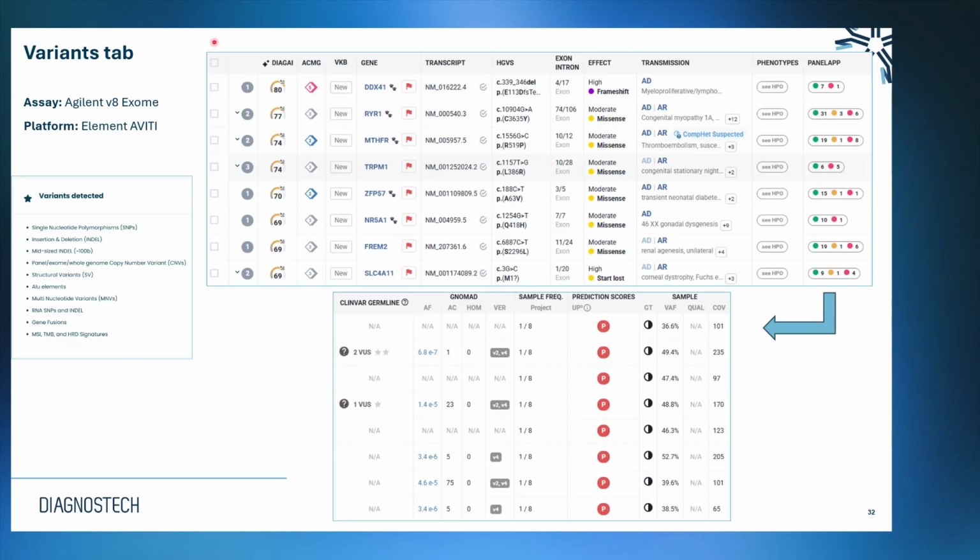So what we're looking at here is really the first step of variant interpretation. This is after the tertiary analysis has completed, and I've just taken a snapshot of 8 of the top variants. So this is one sample and all the variants. And it continues on the page. So this is the same 8 variants, just the end of the page. I couldn't fit it on one screen. So let's go through some of these things at the top.